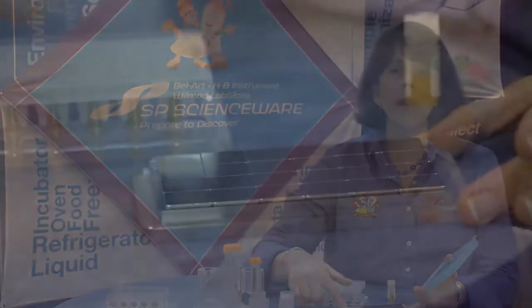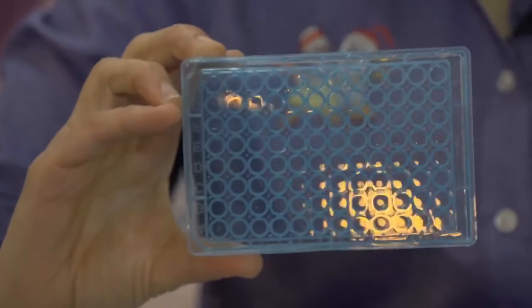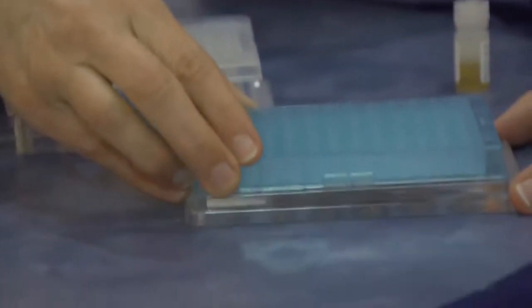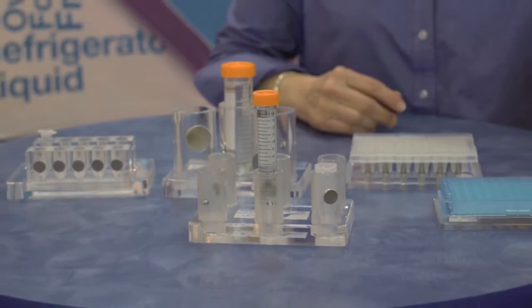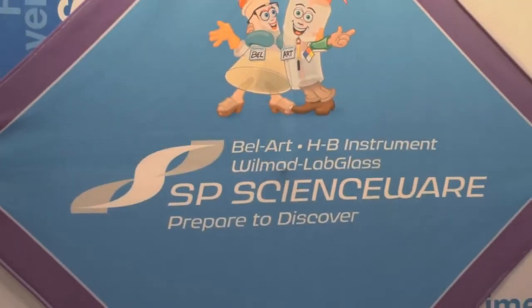The standard microplate rack has 24 magnets which are flat in shape, aligned on the top surface of the rack. There's a lip formed by the magnets, which helps stabilize my microplate. Flat bottom microplates with any number of wells will allow the beads to collect on the bottom of the wells, so the addition or decanting of liquids is much easier.